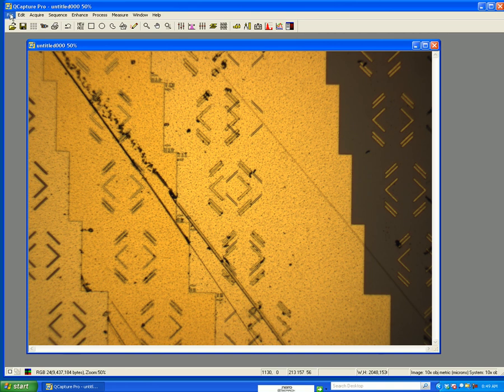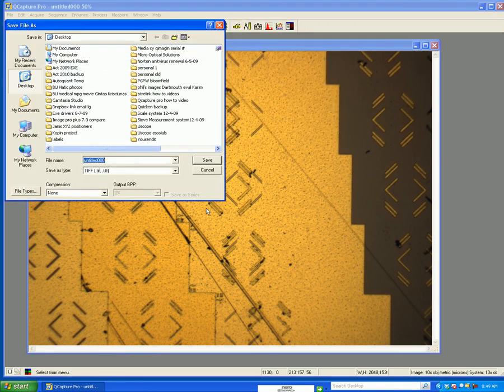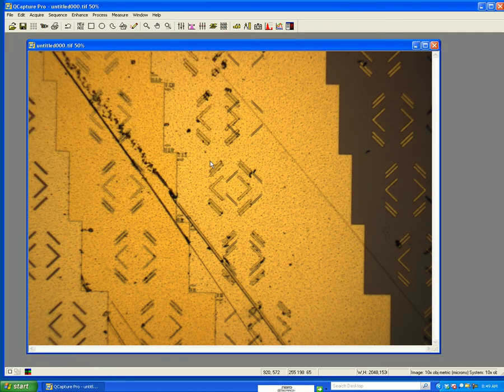Last, I want to save this, so I go to File, Save As. I'm going to save this as a TIFF. You have other formats. I'm going to name it. I'm going to put it on the desktop. I can put this anywhere I want and save this image.